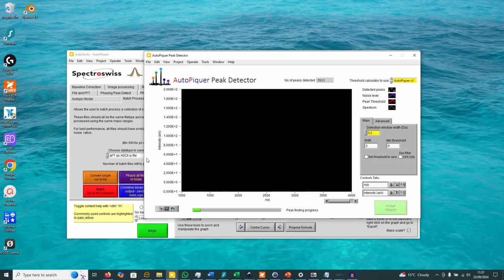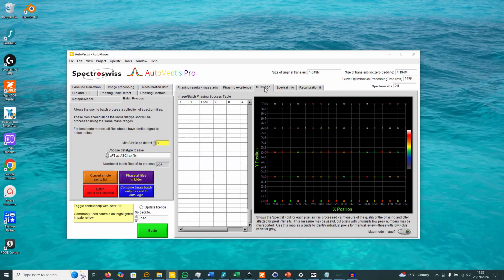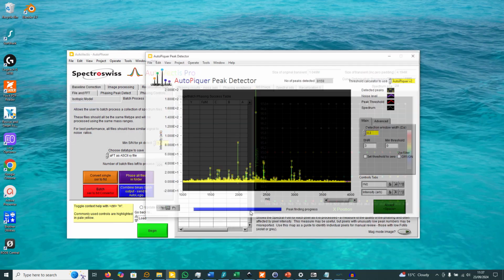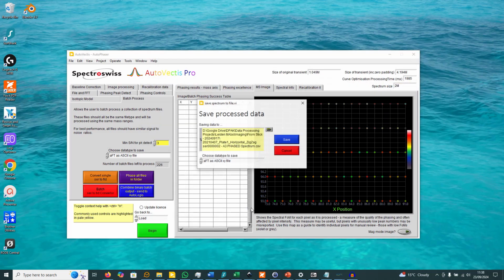You can see on the batch process tab number of files left to process. It'll show in a minute. So 227 files left to process. And you can, on this tab, oops, just have to wait till I can click on the screen. Oh, they're processing too fast. I'll be able to show you this at the end if necessary. Oh, come on.